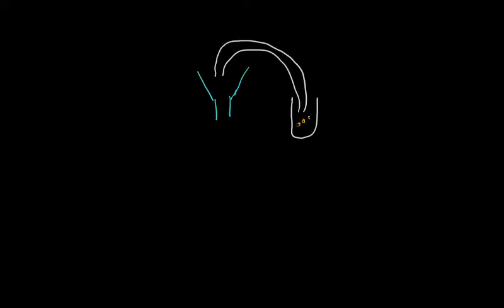There are cells in this. And the sheath fluid enters into the flow cell, the sample enters into the flow cell. In the same way both the sheath and sample here are driven by hydrodynamic focusing, and we have the cells here, and there is a laser.